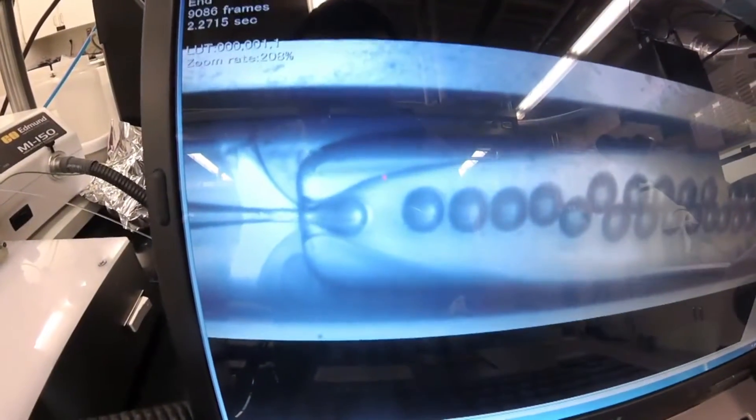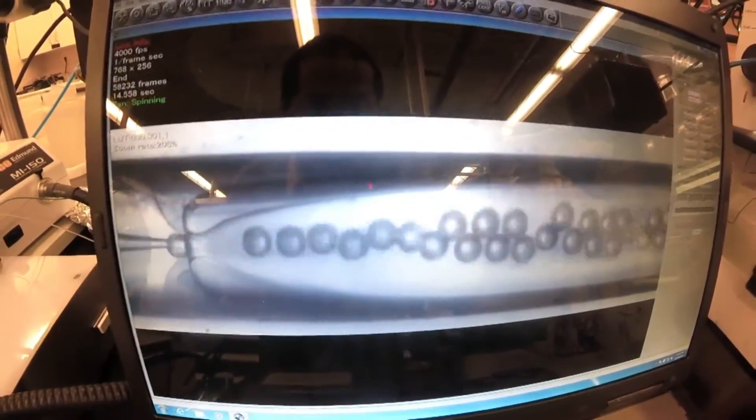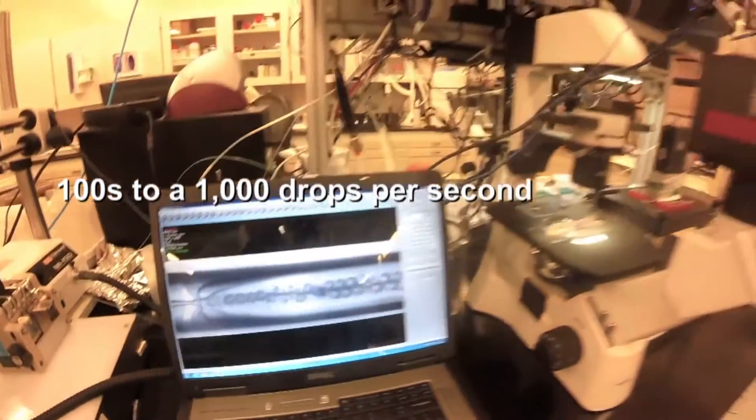What you see here is a slowed-down playback. As you can see, we're making these drops and they're very monodispersed. If I put it into real time, this is what you'll be looking at. We're making hundreds and thousands of drops per second.